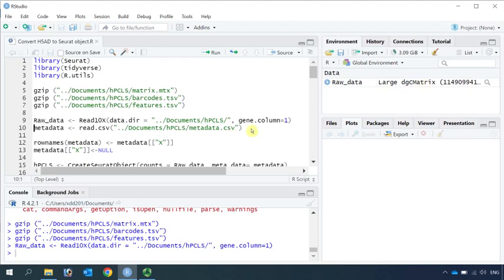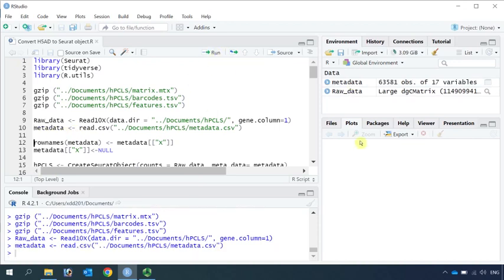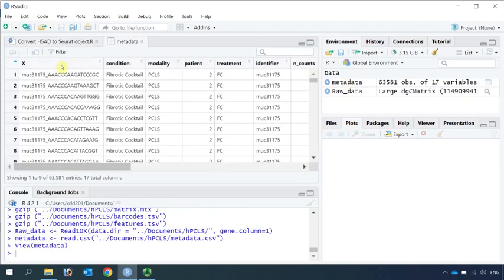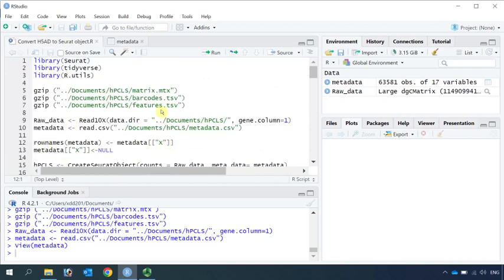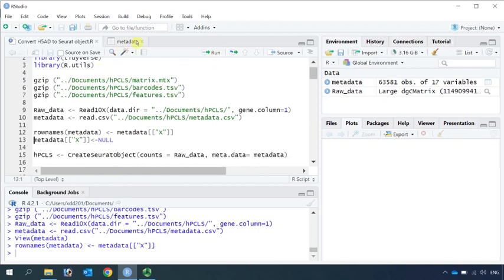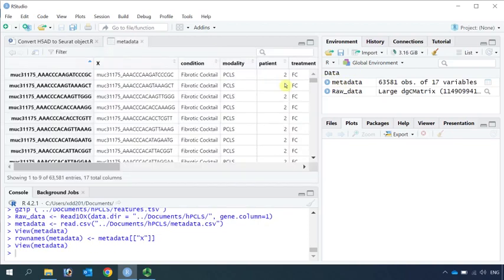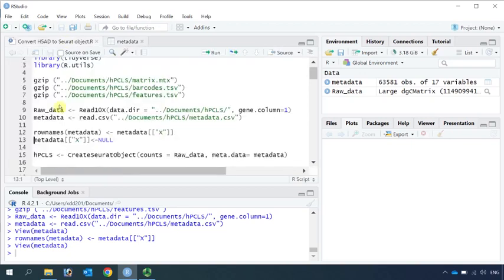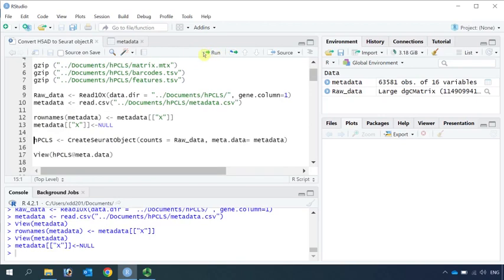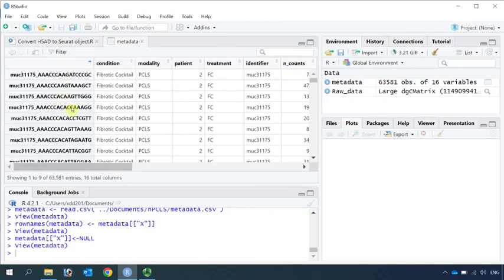In order to produce the same cell pattern, we need to read the metadata as well. So we have the metadata — let's have a look at it. The barcodes are in the first column named as X, so we can assign this to the row names. Now if we look at the metadata, the row names are barcodes. But the barcodes are still in the first column, so we can delete that column. Now we have a proper metadata.